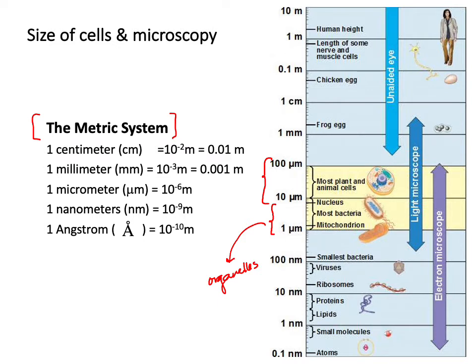I'm going to show you another trick that I did not show you in our previous microscope lab for how to convert. But most of your lab today is going to be estimating cell size and specifically organelle size inside those cells. And so let's actually look at what we're going to be doing today, both how to use the microscope, but also how to estimate and calculate cell size.